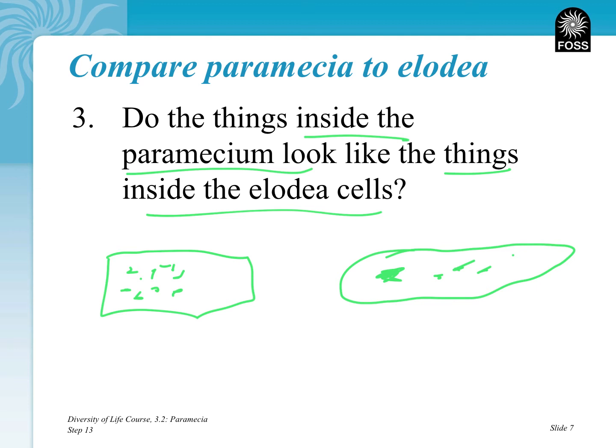They are bound within a structure, like a box or a brick or a paramecium. It's kind of a flowing cigar-shaped looking thing, but they do have things inside them. And those same structures we see in the paramecium are actually very similar to some of these structures inside the Elodea cells. And we'll look at those in more detail.